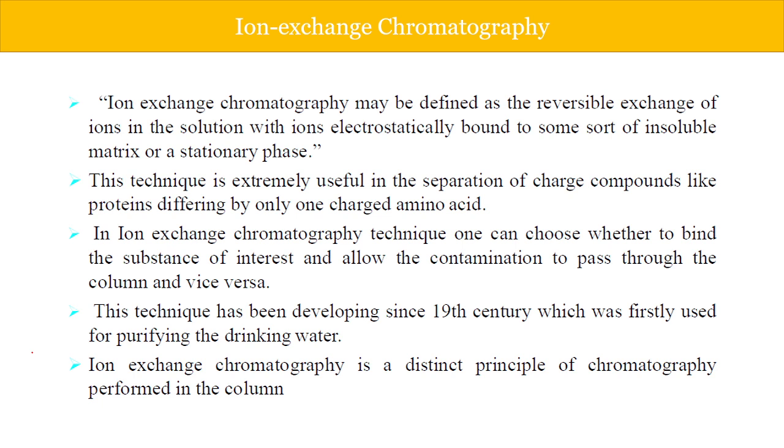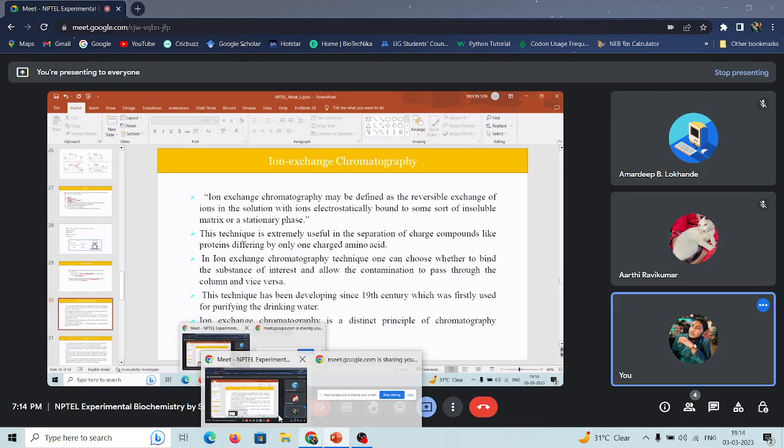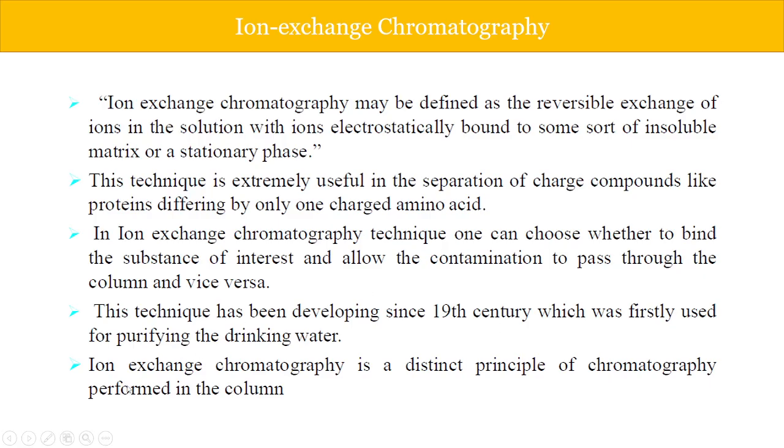So your ion exchange chromatography is defined as the reversible exchange of your ions in the solution with the ions which electrostatically bind to some sort of insoluble matrix or a stationary phase.